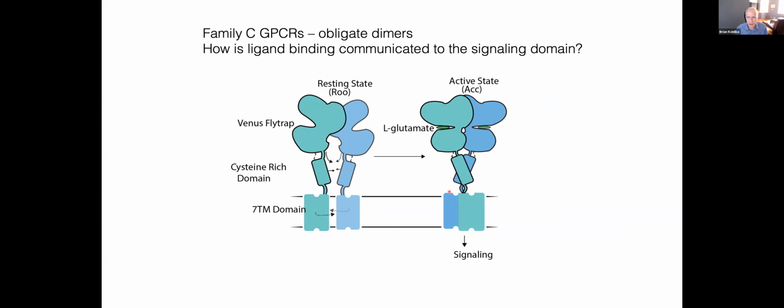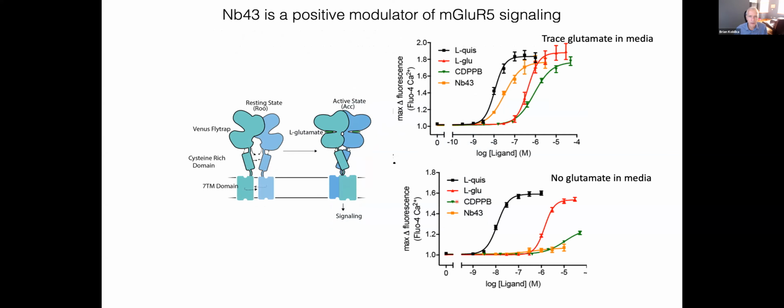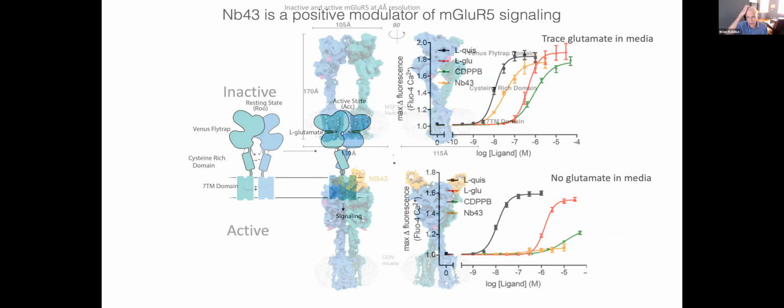So upon activation, the ligand binds to these large extracellular domains, and that leads to a rearrangement of the transmembrane domains. And we were interested in finding out what that rearrangement was. In order to get the fully active state, we had to use several different ligands, and I just show the functions over here. I won't discuss them, but we used a full agonist. We also used a positive allosteric modulator that binds in the transmembrane domains. And then we have a nanobody that is also an allosteric modulator that stabilized yet again the fully active conformation. And all of these were used to enable us to see both inactive and active states.